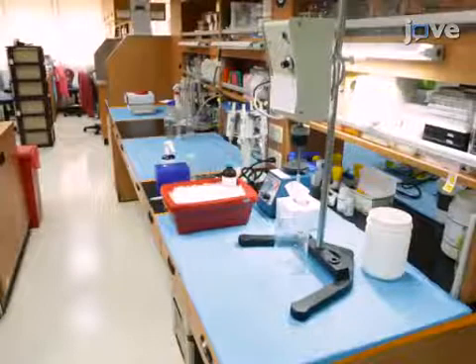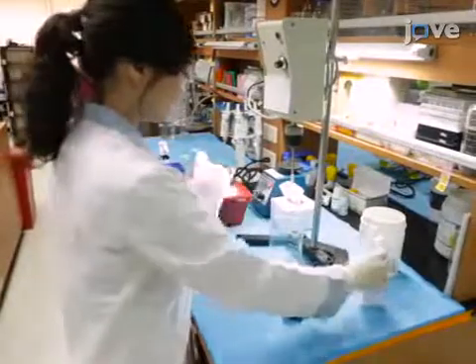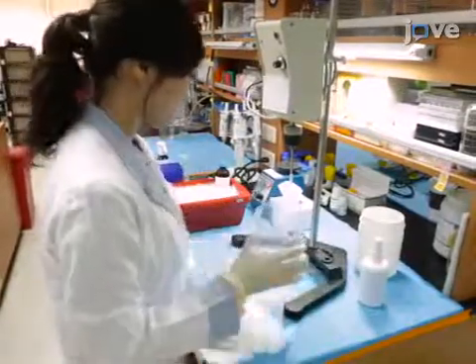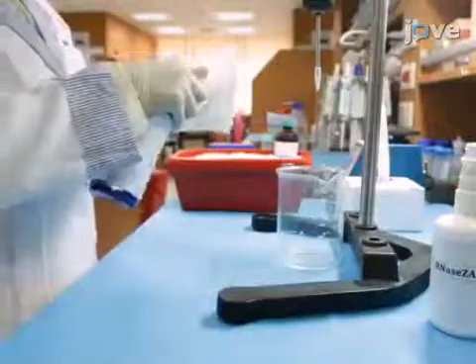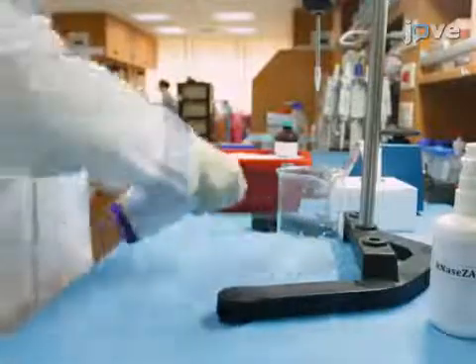To begin the experiment, spray ribonuclease decontamination solution onto paper towels and wipe down the pipettes and lab bench surfaces. Wet the paper towels with nuclease-free water and wipe down the pipettes and lab bench surfaces again.